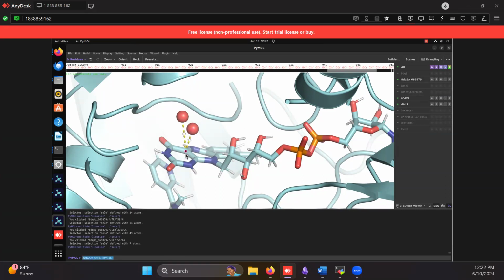If you want to select by default, any selection will select the entire residue. To change this, at the top left, instead of residues, you can go to atom and then select just the atom you're looking at. So I've selected just the C4X atom. And I want to see the distance between the C4X and the oxygen. And delete distance once I can show this. So this is without the command, and once I get the command, it shows the distance and the values for the distance here.